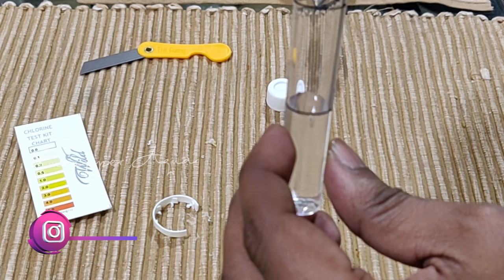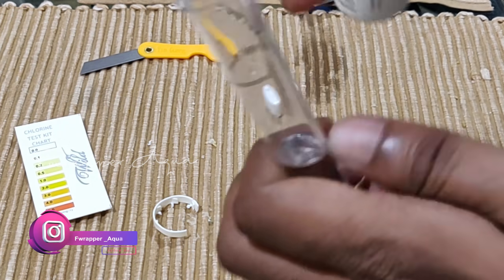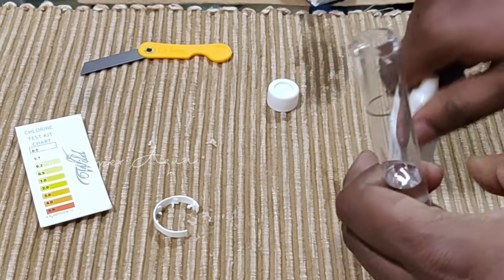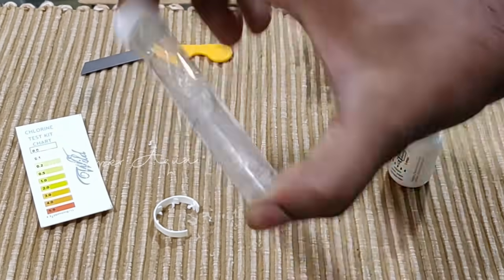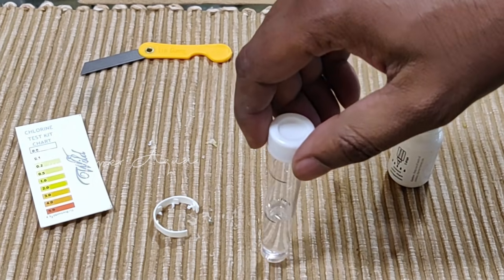Let me add 5 drops as per the instructions: 1, 2, 3, 4, 5. I'm going to mix it really well and let it settle.